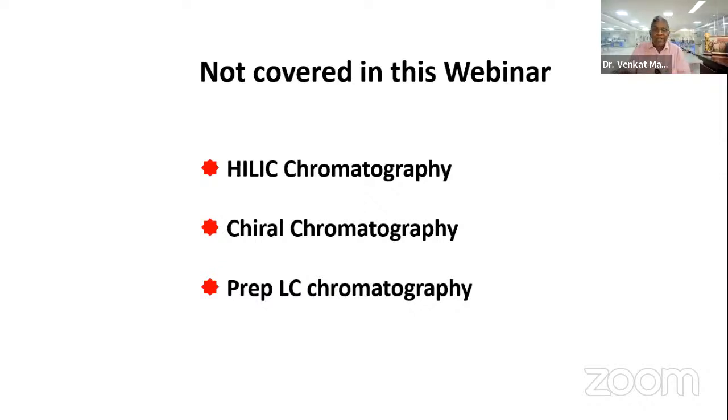I will not make this part of this seminar. We will talk about this maybe in subsequent seminars. I will not talk much because this is altogether a different kind of chemistry, and it's a very, very interesting topic, and particularly HILIC and chiral is one of the fantastic topics which has completely revolutionized the pharma industry, I want to say, and also food industries.